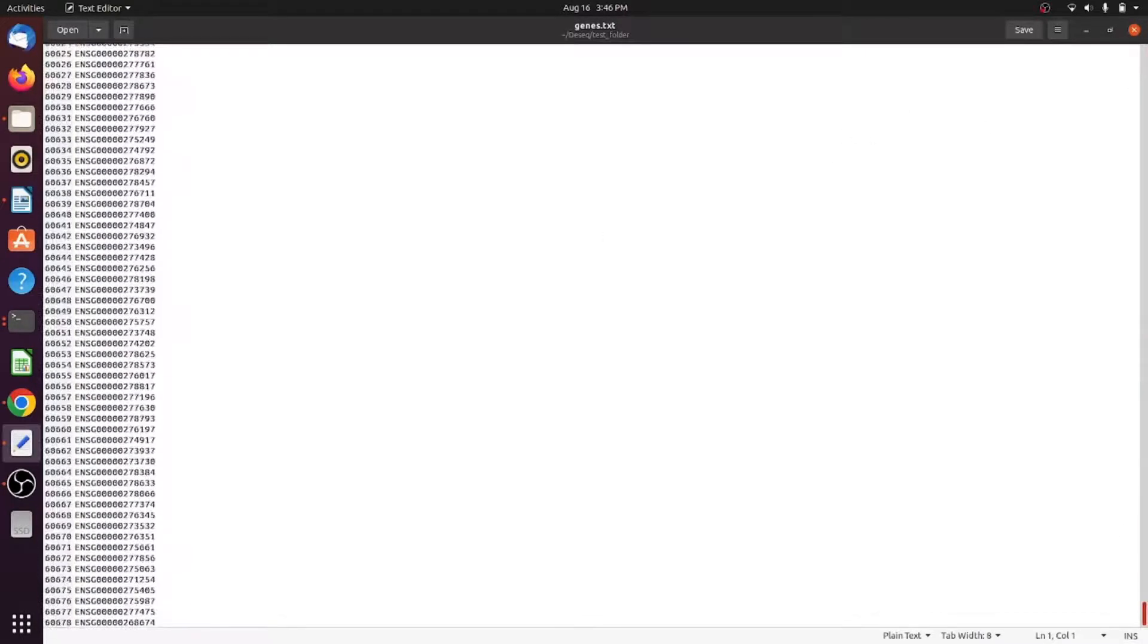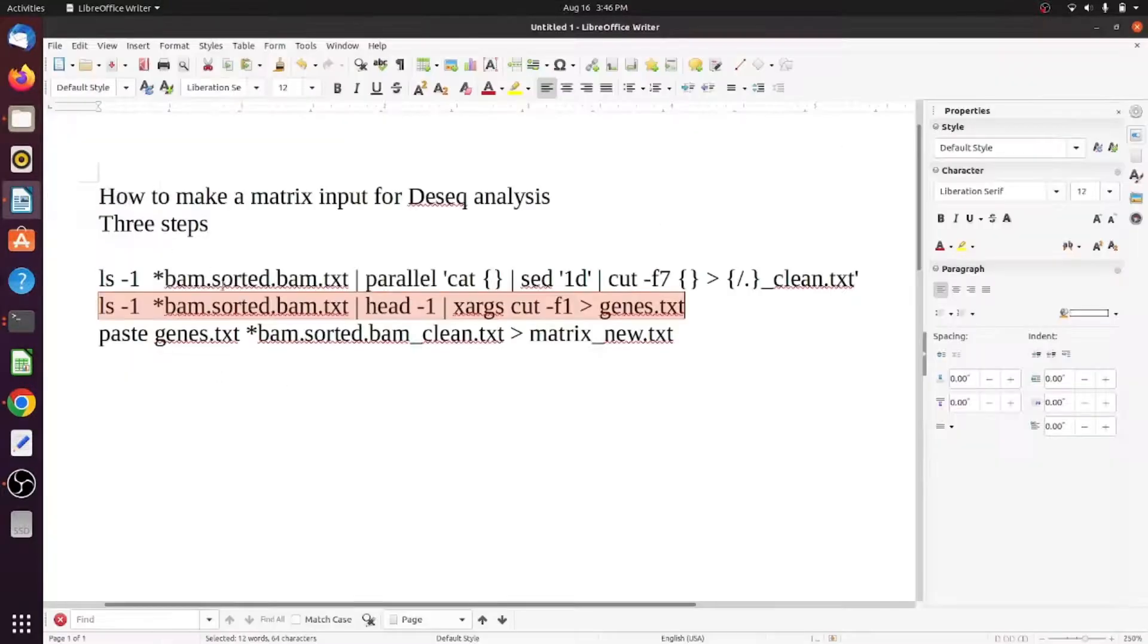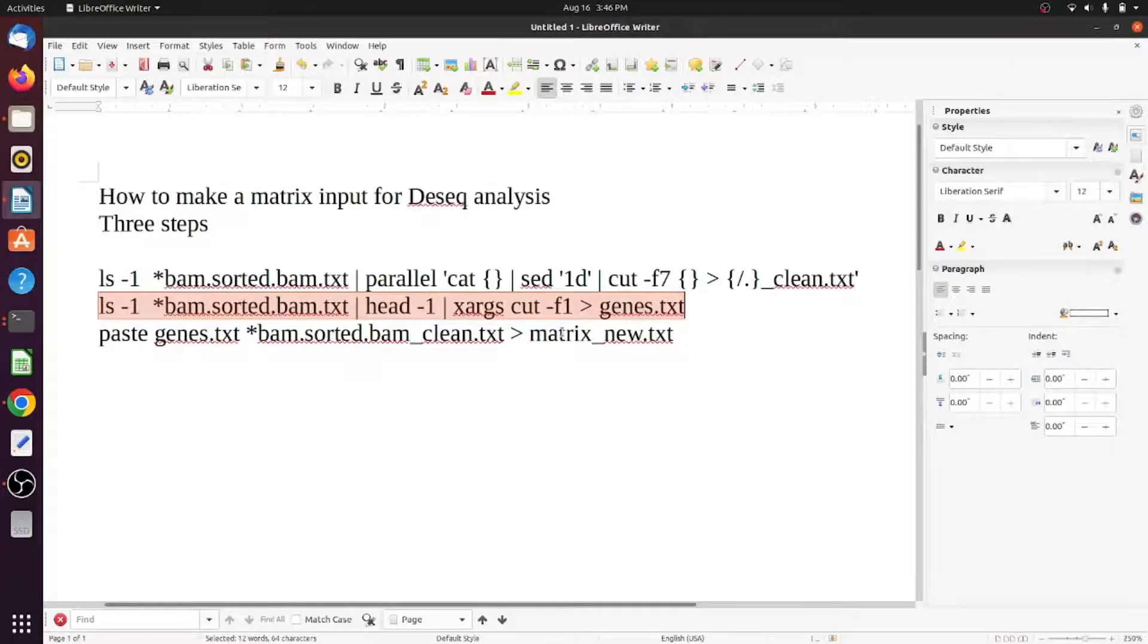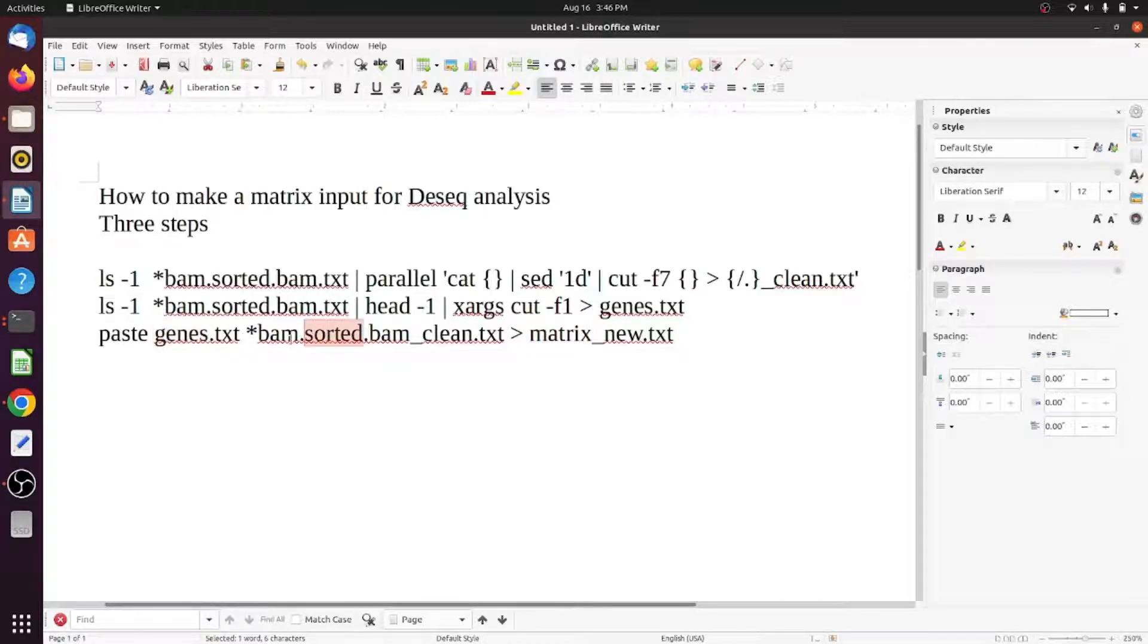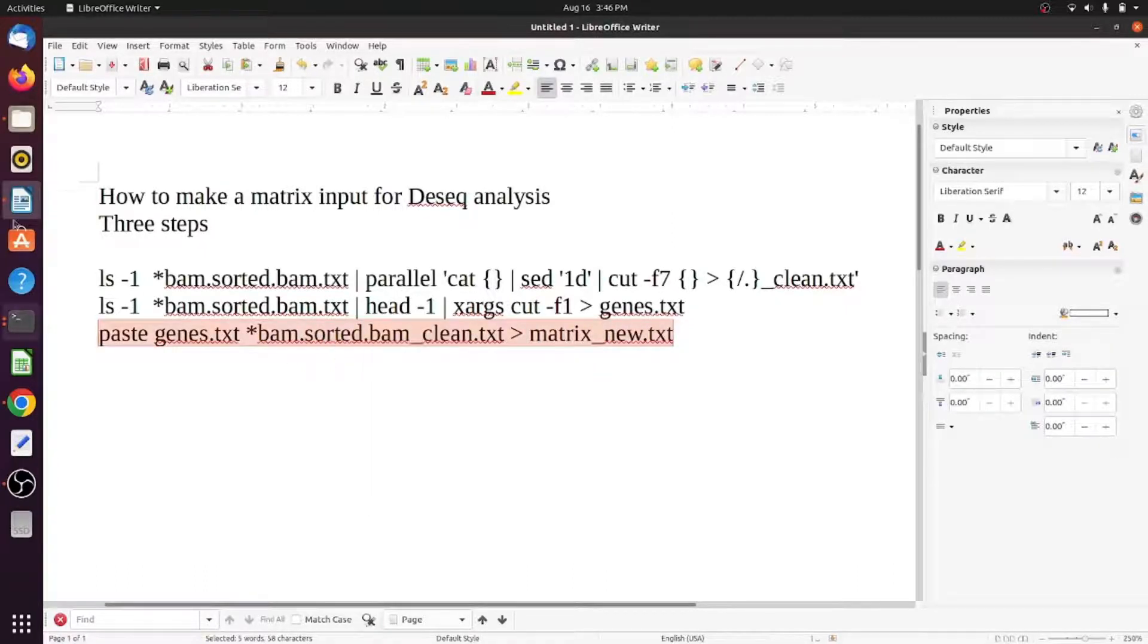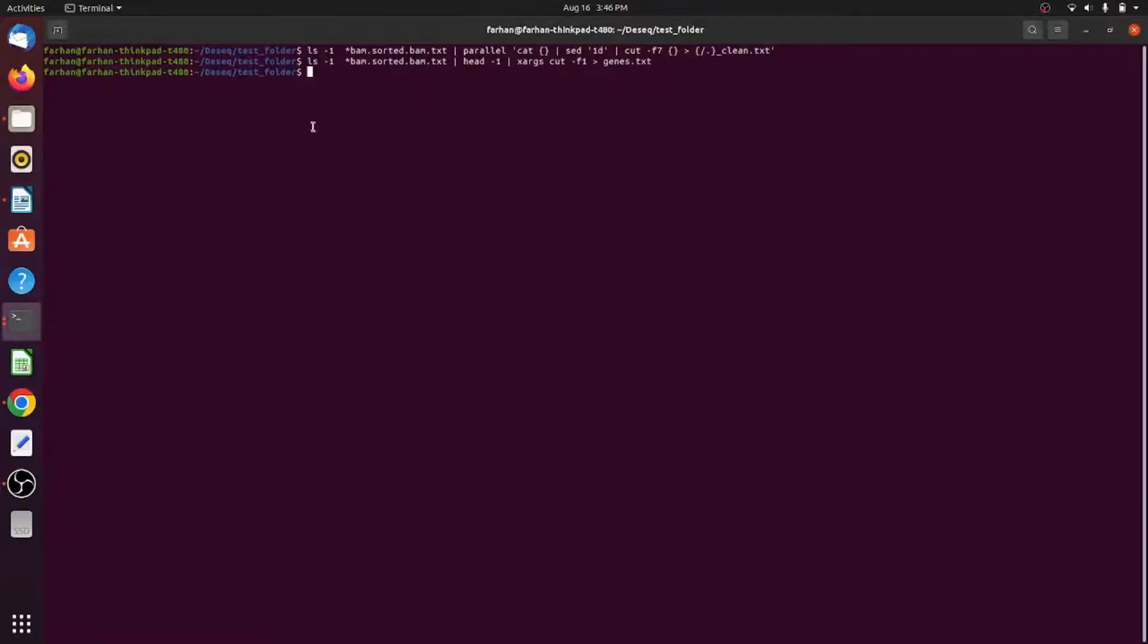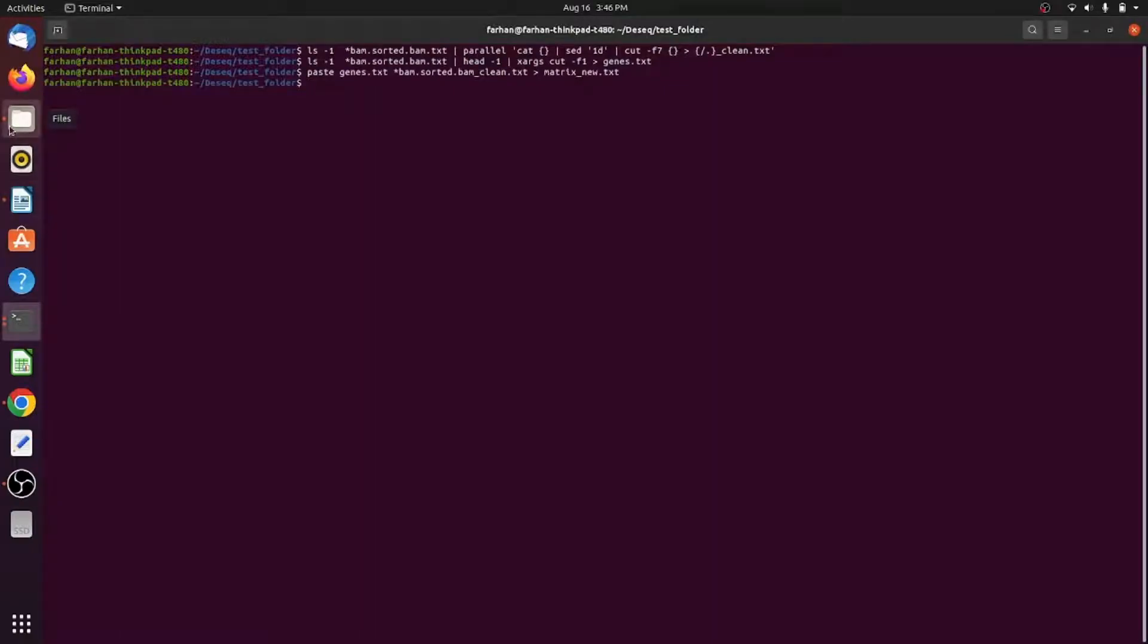Now the last command is to combine it into a matrix form - that's what you need for differential expression analysis. It's taking the gene output and all the BAM sorted clean outputs and writing it into a matrix file. Just write paste and enter, and now you can see this is the matrix output.